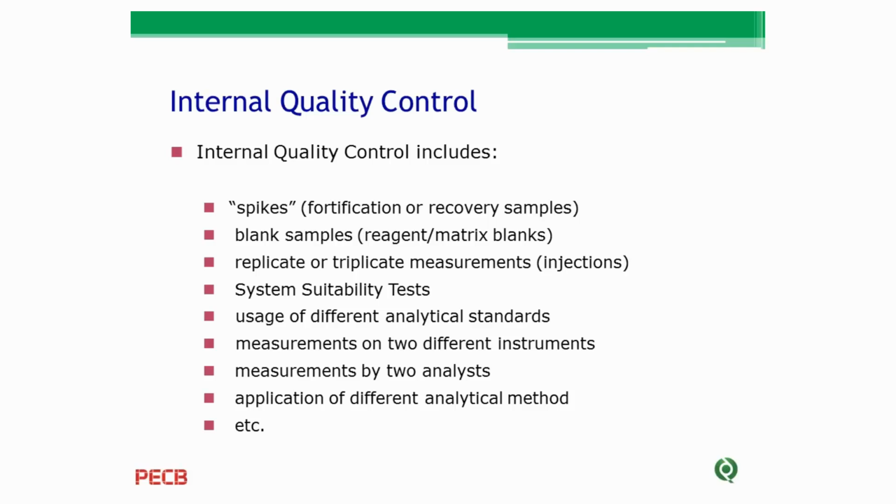System suitability tests: for some laboratory equipment, these tests are defined, and at the beginning of every run we use these tests. Usage of different analytical standards: sometimes when we use an analytical reference standard or reference material to calibrate our device, it would be a very good idea for the laboratory to check its own measurement procedure with an independent reference standard to see if everything is okay with the measurement system.